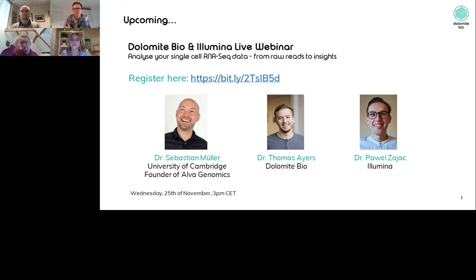So I noticed there, Adam, you were also working, as well as tendons, with some myocardium perhaps, or that kind of cell where you get very, very long multinucleated cells. We do have some users who are also able to run those very large cells on the Nadia platform as well. But obviously, it's all due to exactly how well you get rid of that debris in the first place.